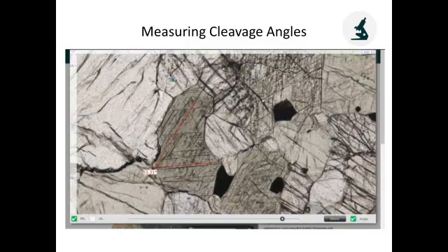Click, drag. That tells you the size of the grain. Click and drag again. 60 degrees, 61 degrees. So in this case, it was exactly the right angle. There's a reason why those two are slightly different. They're very characteristic. They're both amphibole. There's a little bit of difference that if you think about it, you'll understand why.